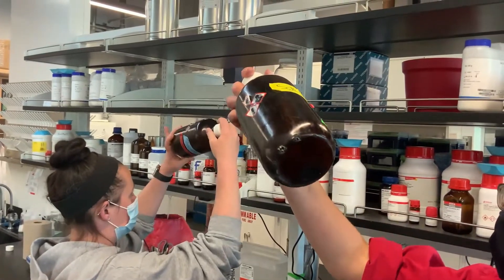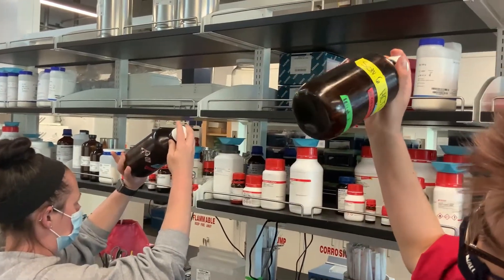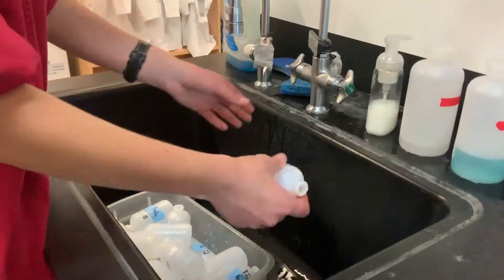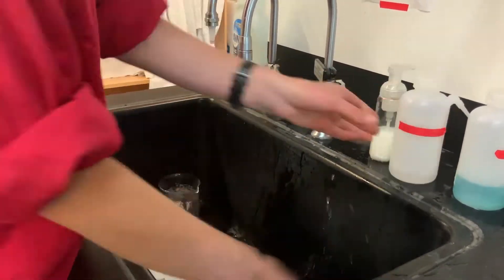The other reagents should be inspected for precipitates or clumps in the bottles. If you find any, the reagent should be dumped, rinsed, and air dried. If the reagents don't contain any precipitates, they don't need to be disposed of. Wash the amino acid bottles with water, ethanol, water, then ethanol again, and let them dry.